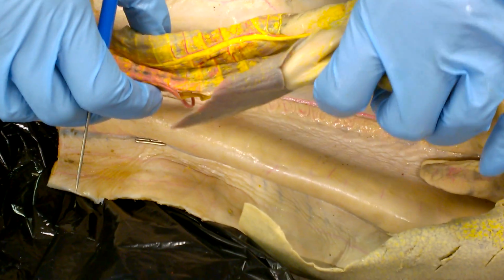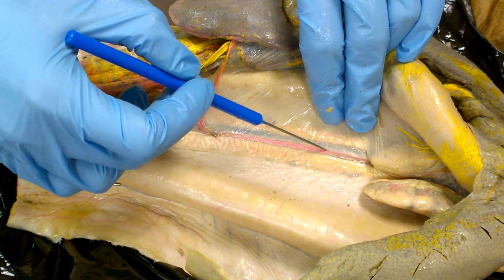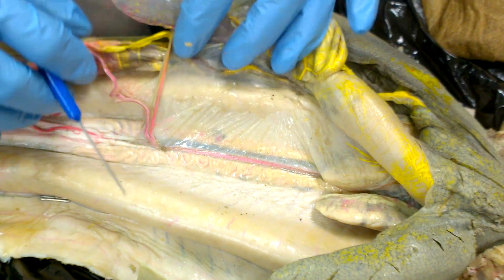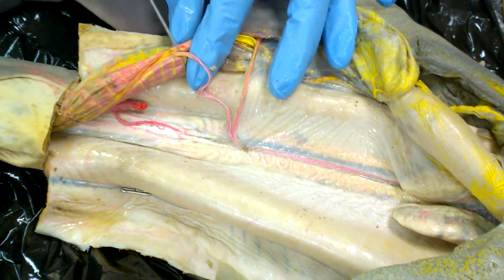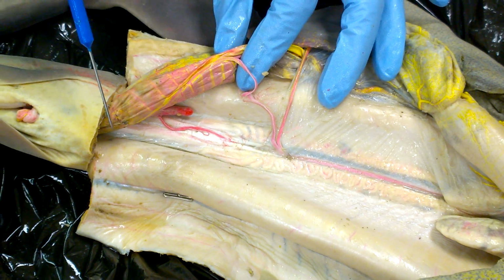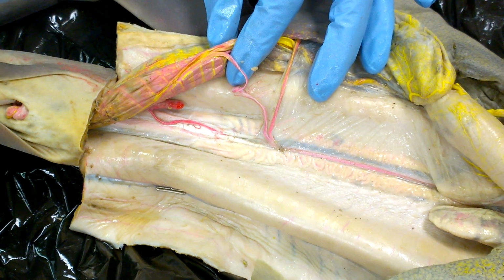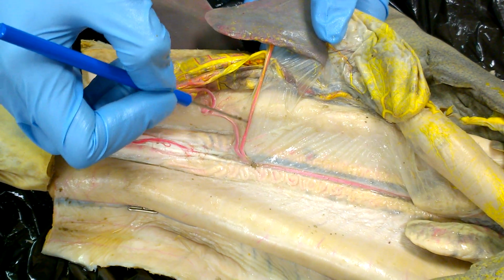Good so far. Okay, so then we come back to, what's this right here? Dorsal aorta. Excellent. And so then we're going to have this branch comes off, and you can see it just joins the intestine here at the back part. So it is going to be the posterior intestinal artery. Perfect. And then it also branches into branches that wrap around. Annular arteries. Outstanding.